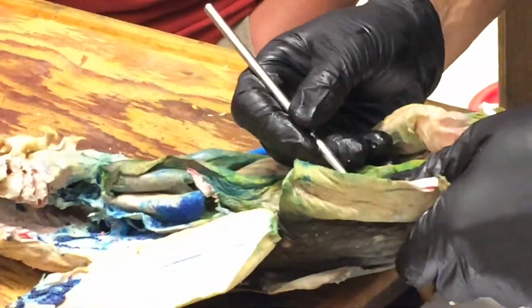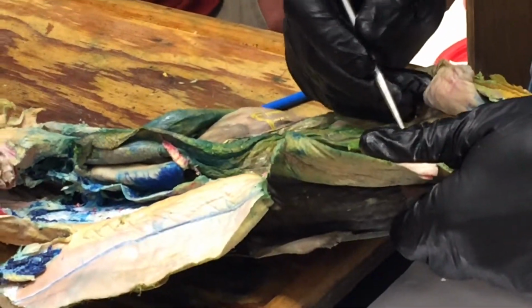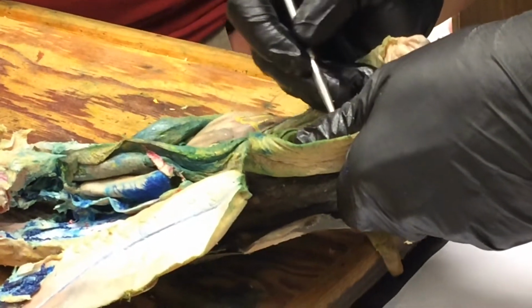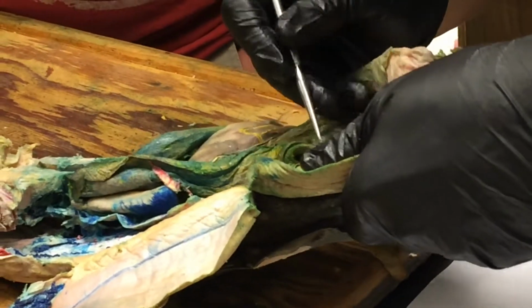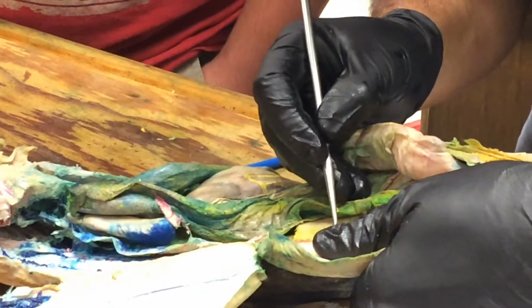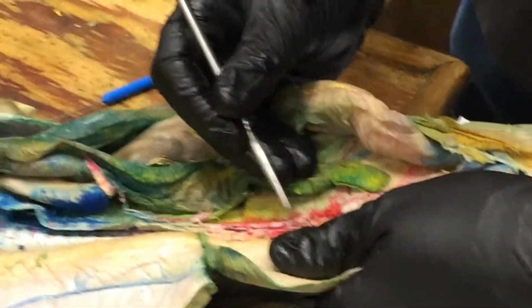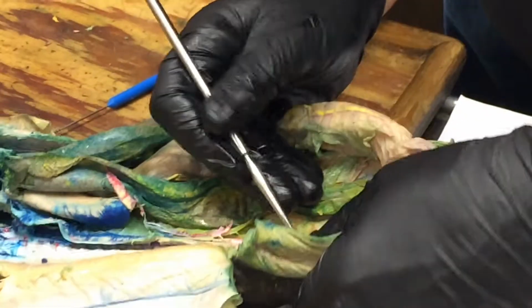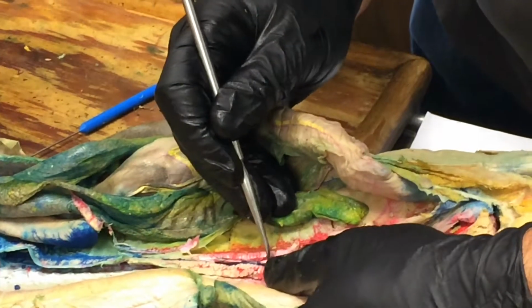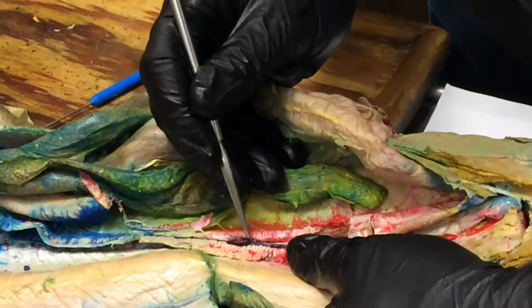Where you're going to find it is along the medial side of the kidney. Unfortunately, I sort of butchered it, it's a little bit torn up in there. But maybe we'll find it. What's that? Oh, that's caudal ligament. So that's why you have to worry about caudal ligaments, because it looks like it should be some part of this system, and yet it's not. Ah, wait, I see it. Oh, nope, that's more caudal ligament. Never mind, sorry.